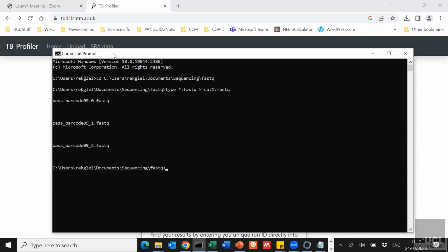So I found it, say, 14, if it's the other way around, depends. So I tend to use it because it's easier to see and understand.